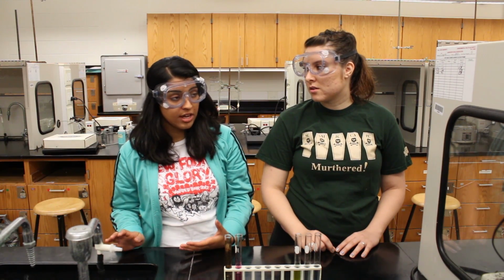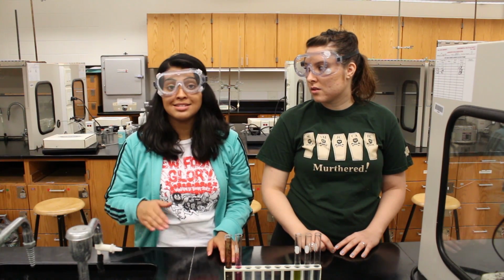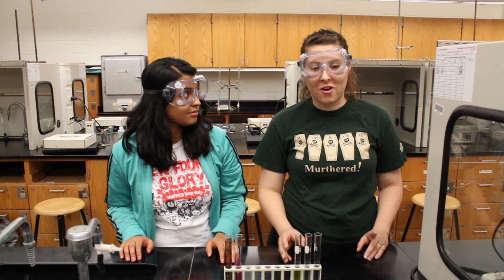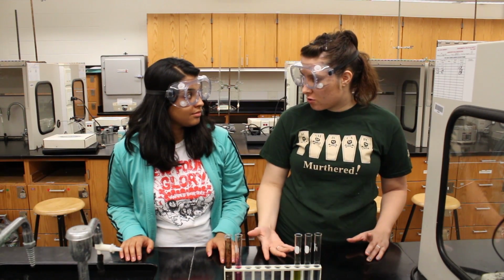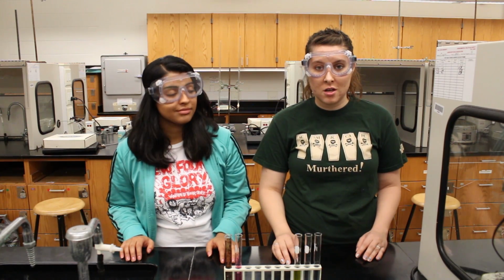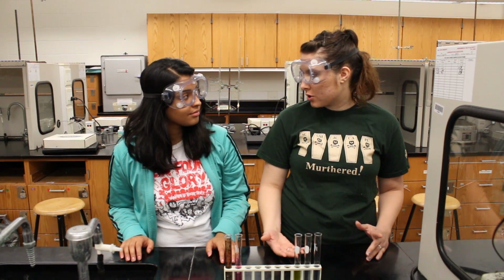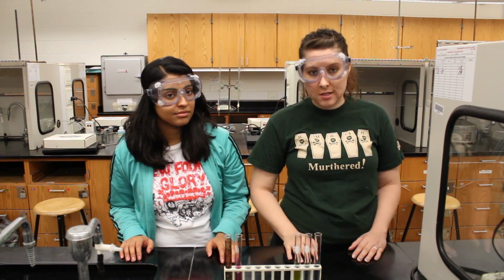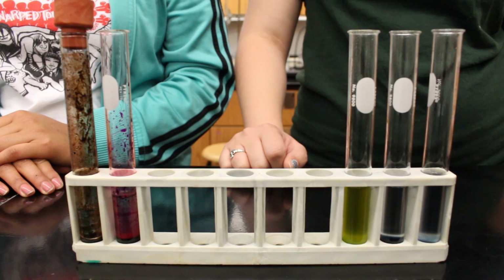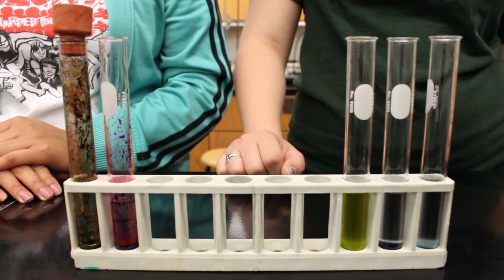In order to form that double bond, there must be a free hydrogen atom on the hydroxyl group and the adjacent carbon atom. That's right. In a tertiary alcohol, the carbon attached to the hydroxyl group has 3 other carbons attached, so there's no room for the hydrogen. So we'll be able to tell which alcohol is tertiary by whether or not it undergoes oxidation. And we'll also be able to distinguish primary and secondary alcohols because of the different products.